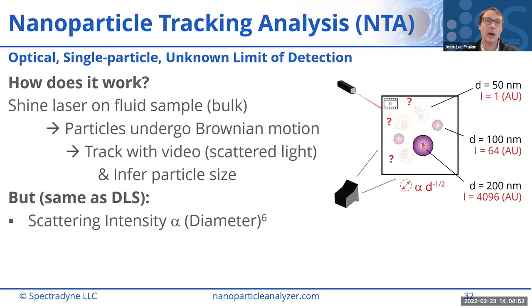So our limit of detection is an effective spherical diameter. Speaking very carefully, it's the volume of a particle whose effective spherical diameter is 50 nanometers. So if you have a very thin sheet, it's going to have to be huge in order to add up to enough volume to meet the volume of a 50 nanometer particle.